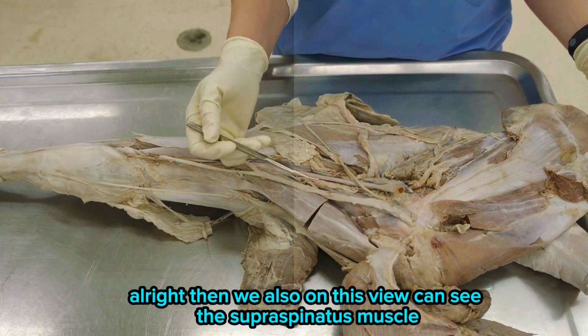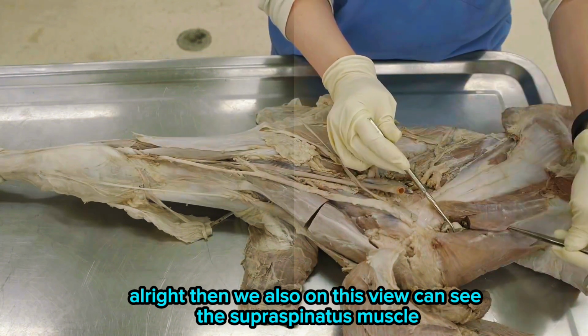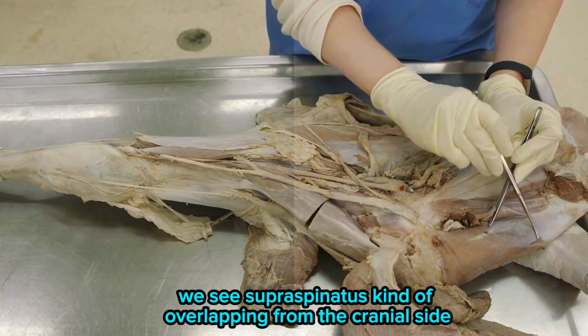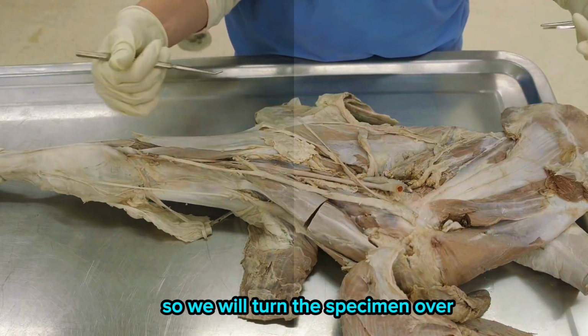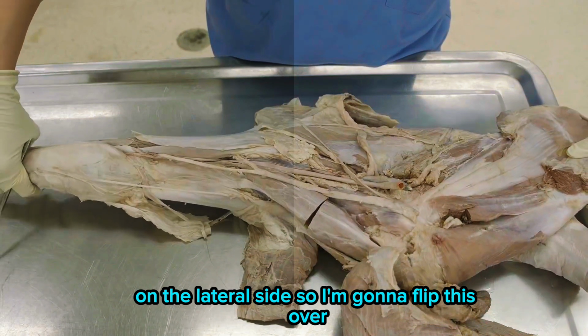All right, then on this view we can also see the supraspinatus muscle. Here was the subscapularis muscle, and then on this cranial edge we see the supraspinatus overlapping from the cranial side. We will turn the specimen over and take a look at some of the muscles on the other side, on the lateral side. So I'm going to flip this over.